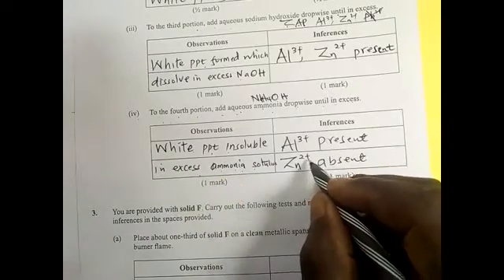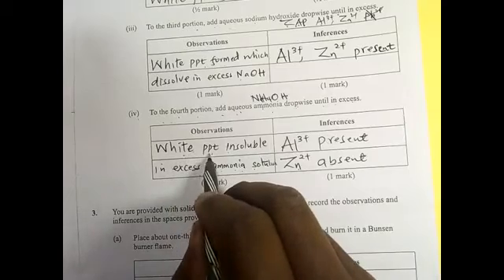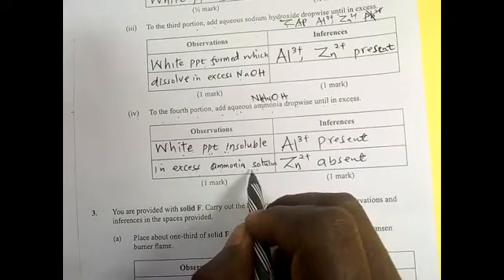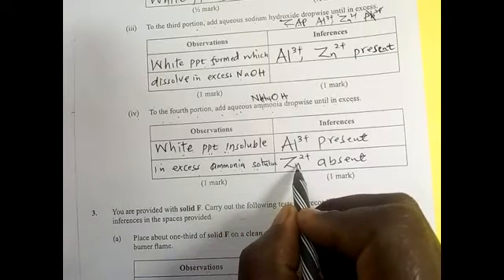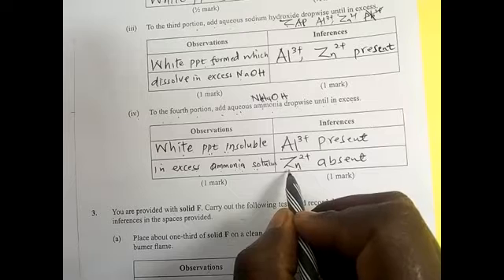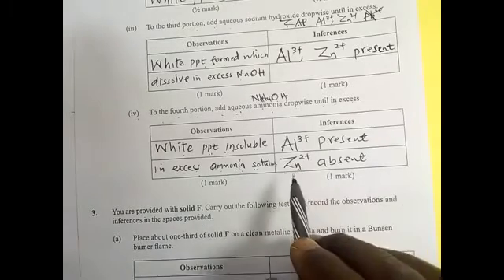Remember, if the zinc 2 ions were present, the white precipitate formed would dissolve to form a colorless solution, which is going to form the complex of the zinc. It's called tetraamine zinc 2 ions, the complex salt.